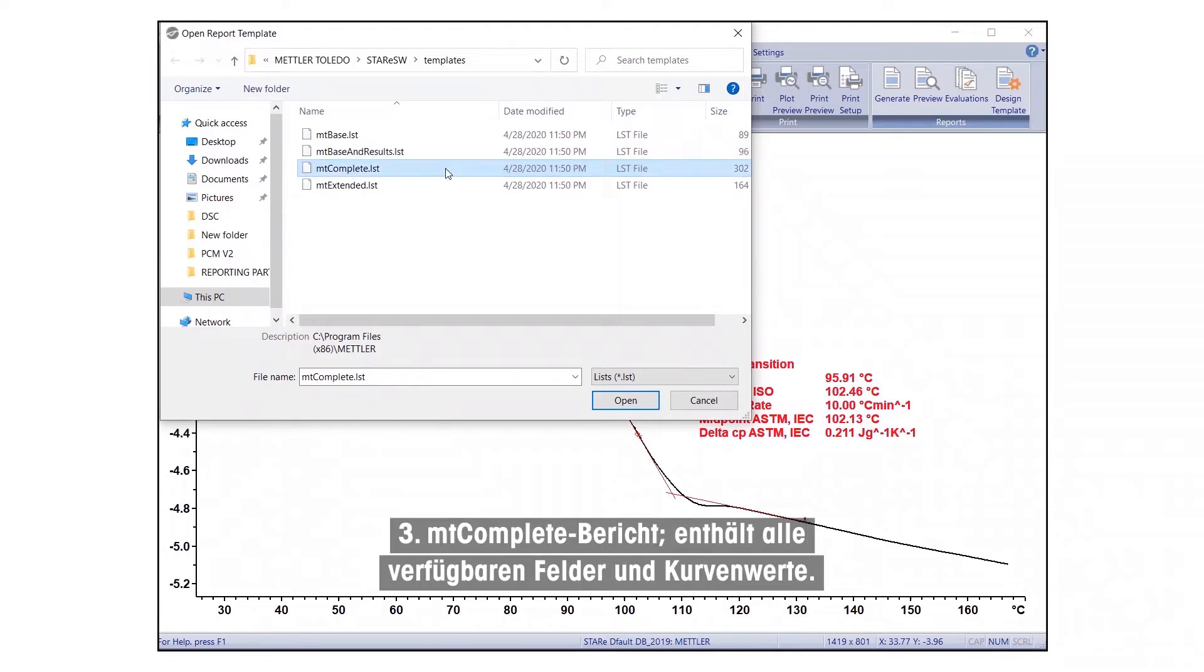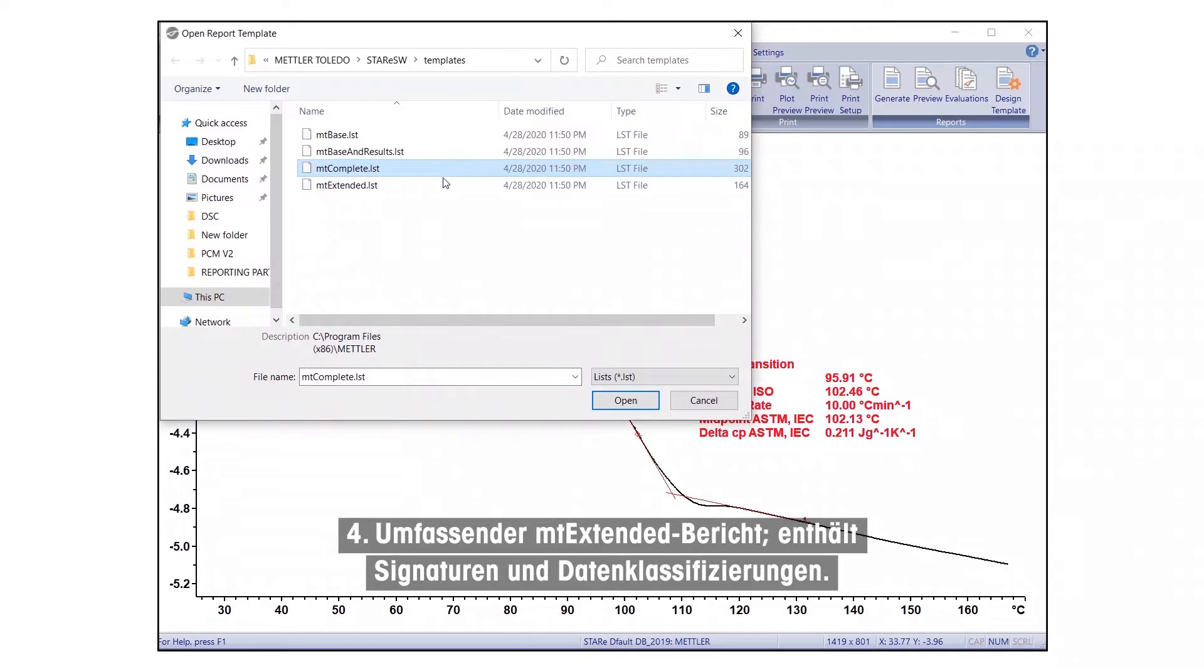MT-Complete report. This report includes all available fields and curve values. And finally, four, an MT-Extended Comprehensive Reports includes signatures and data classifications.